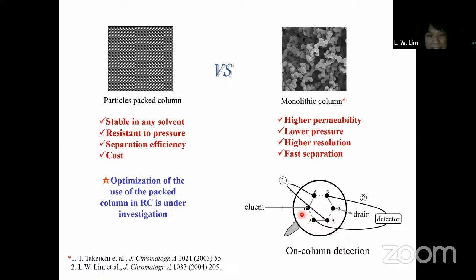And then about fluorescence, I think if you use HPLC grade acetonitrile, you can use it for fluorescence.